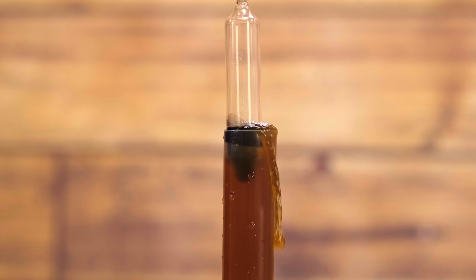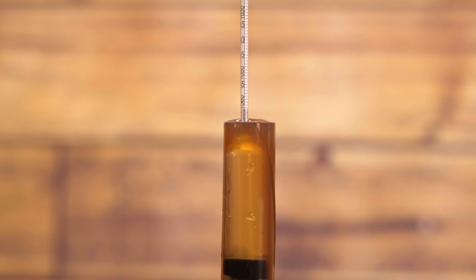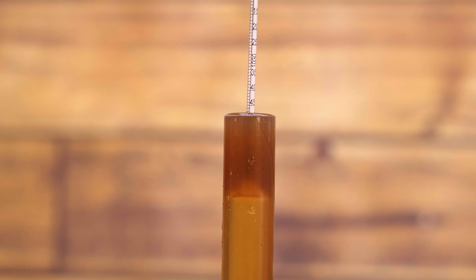We are measuring the amount of sugar in our pre-fermented beer or wort before fermentation takes place. We're then going to take a measurement after fermentation, and then we can do a calculation between the two measurements to give us the amount of alcohol in the beer.